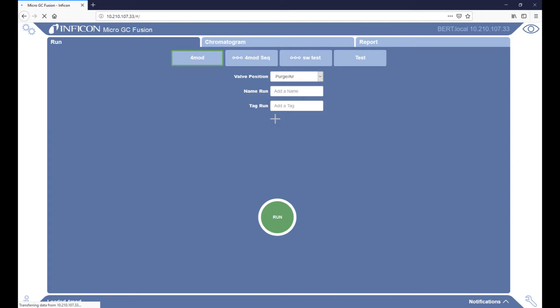This means that when MicroGC Fusion is plugged into a network using an Ethernet cable, the IP address will be automatically assigned. The instrument will find an available IP address and indicate it in the upper right-hand corner.